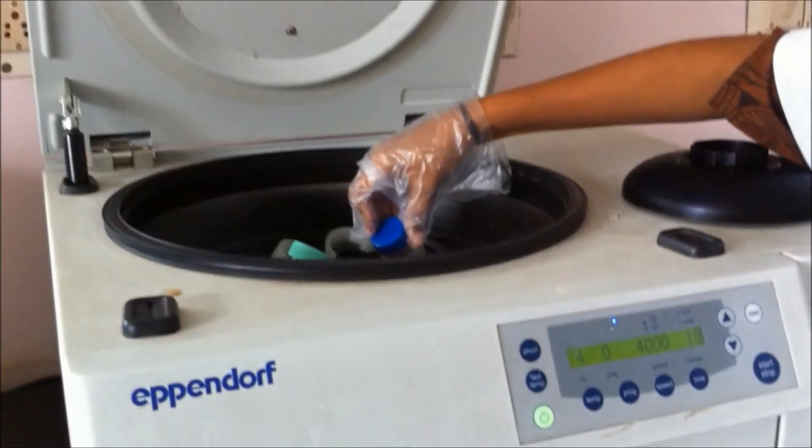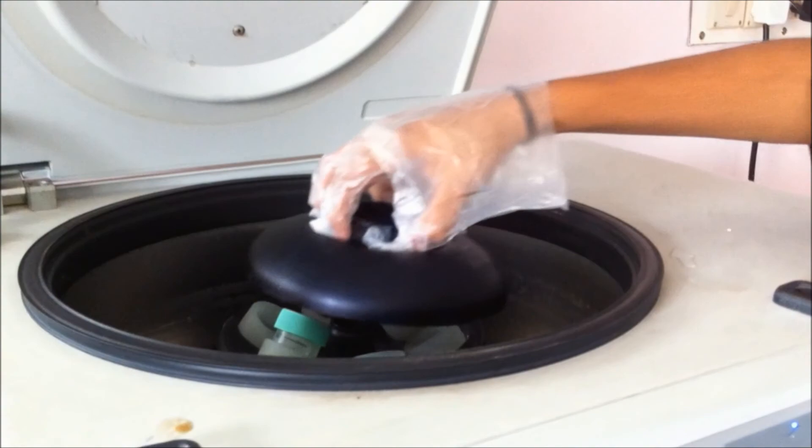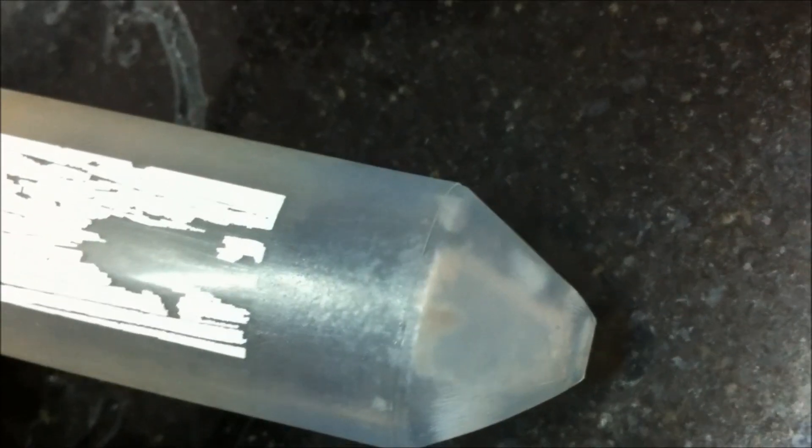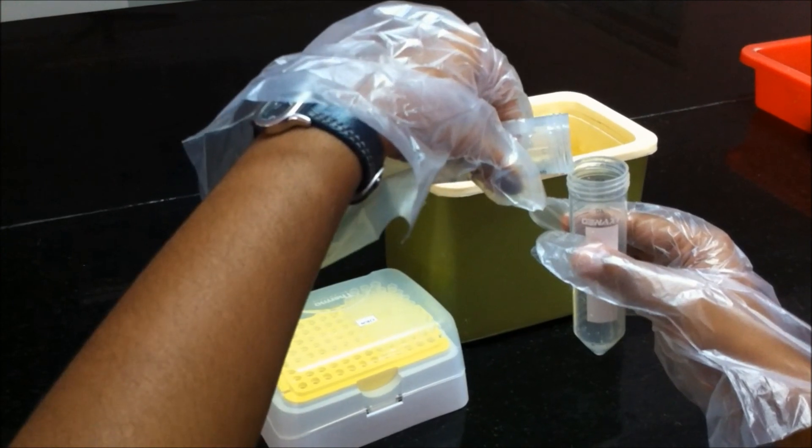Centrifuge at 12,000 rpm for 5 minutes. The supercoiled plasmid DNA and small RNAs remain in the supernatant solution. Hence transfer the supernatant into a fresh falcon tube.